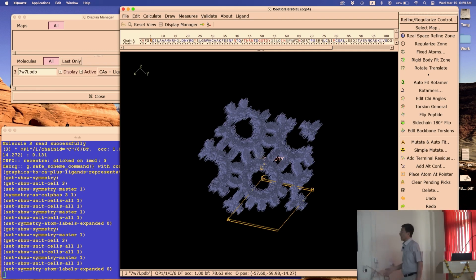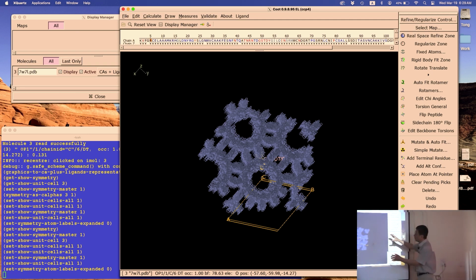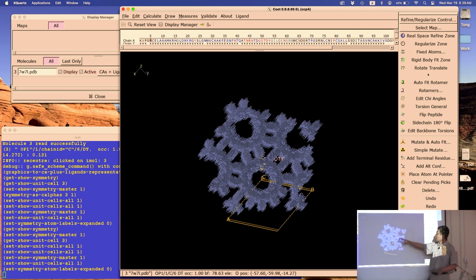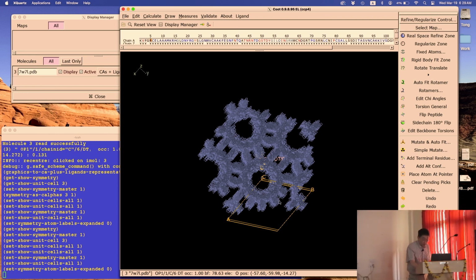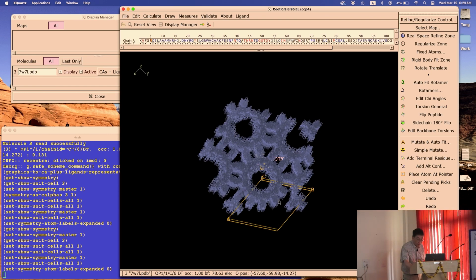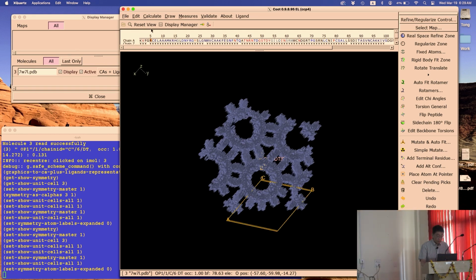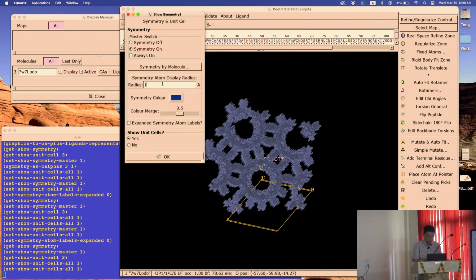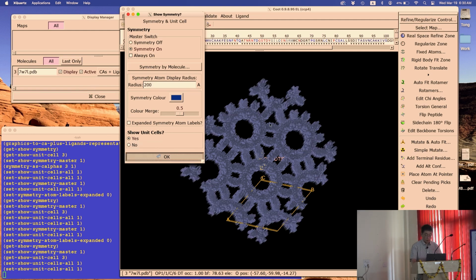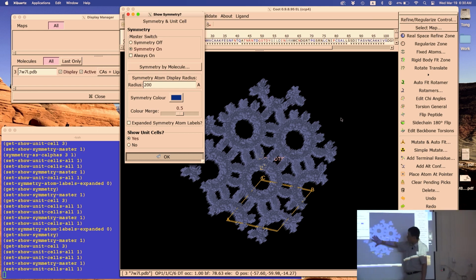Anyway, so the idea, this is just showing you how the molecules are packed into the crystal. And in this case, the packing is so beautiful, almost like a church window or temple window or something. Very beautiful patterns here. And I guess I changed things a little bit. There you go. So let me make that a little bit bigger. So I made mine a little bit bigger still, so you can see the pattern, very beautiful pattern here.